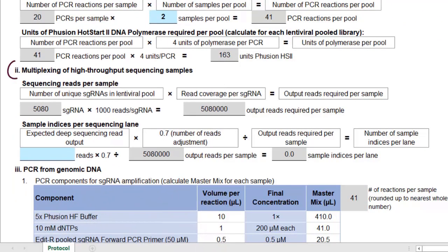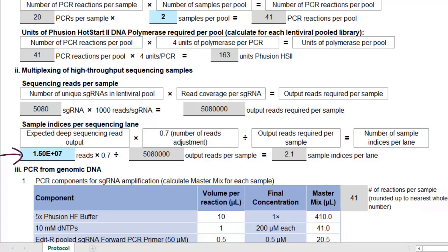Part 2 covers multiplexing, which is running multiple samples in one lane. We recommend a minimum of 1,000 reads per sgRNA, so the tool calculates the number of output reads required per sample. If the output of your sequencing platform is higher than the number of reads required, you may be able to multiplex. For a sequencing platform with an output of 15 million reads per lane, we get 2.1 sample indices per lane. We need to round this down to a whole number, so we can run two samples per lane.